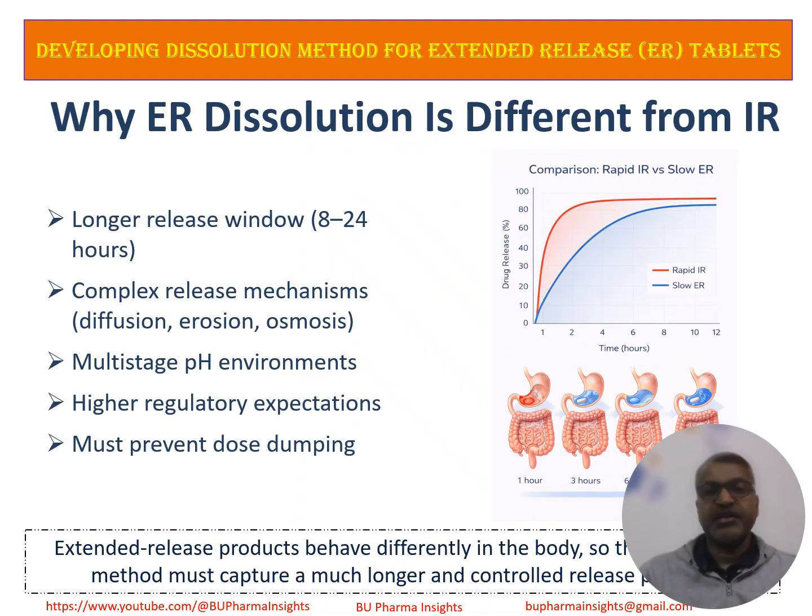Safety is critical, especially for extended release tablets. ER products must not release the drug too quickly because dose dumping can lead to serious safety risks. That's why drug release mechanisms directly guide how we design dissolution methods.